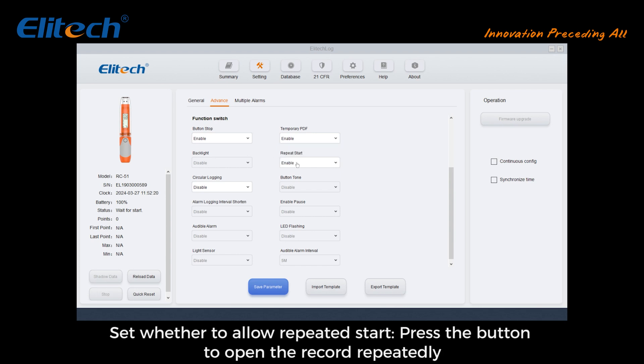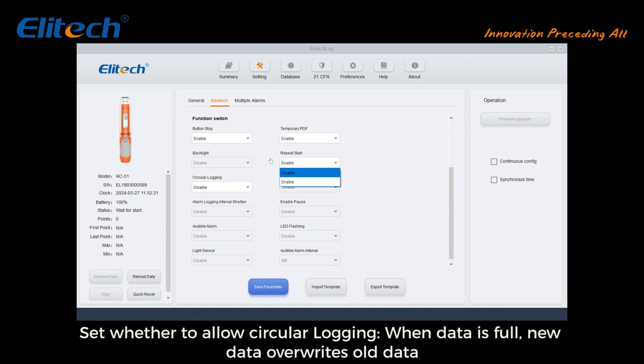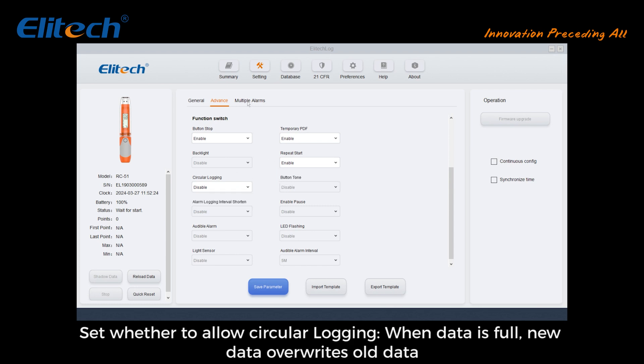Set whether to allow repeated start, which allows pressing the button to open the record repeatedly. Set whether to allow circular logging — when data memory is full, new data will overwrite the old data.